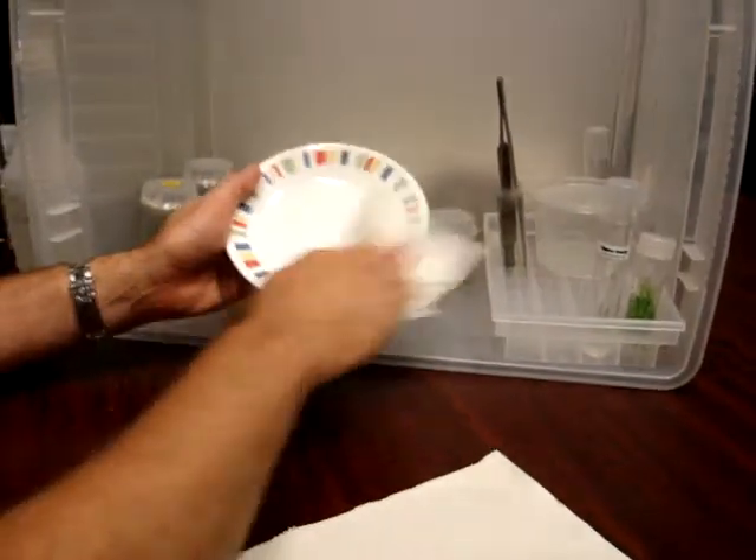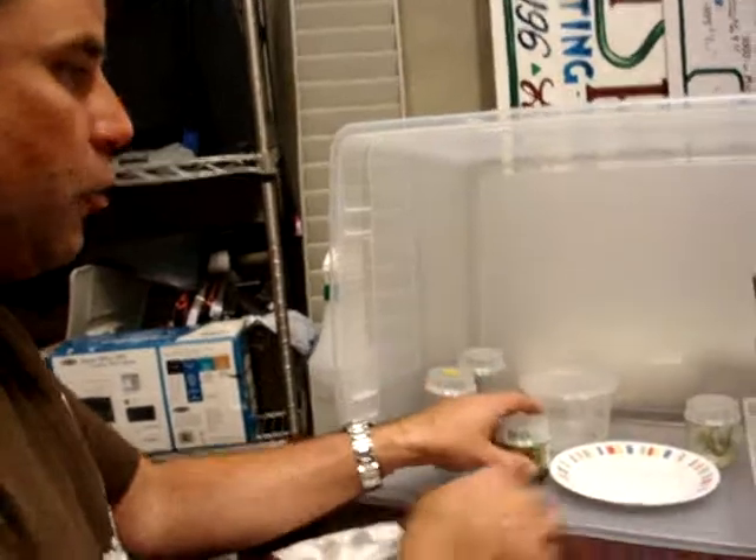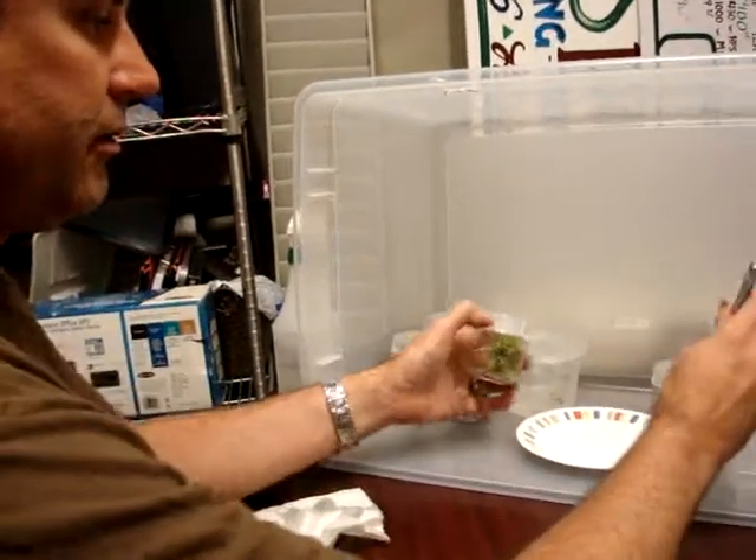Let's give that guy a wipe. So you sort of see the process: spray, wipe, jar, forceps.